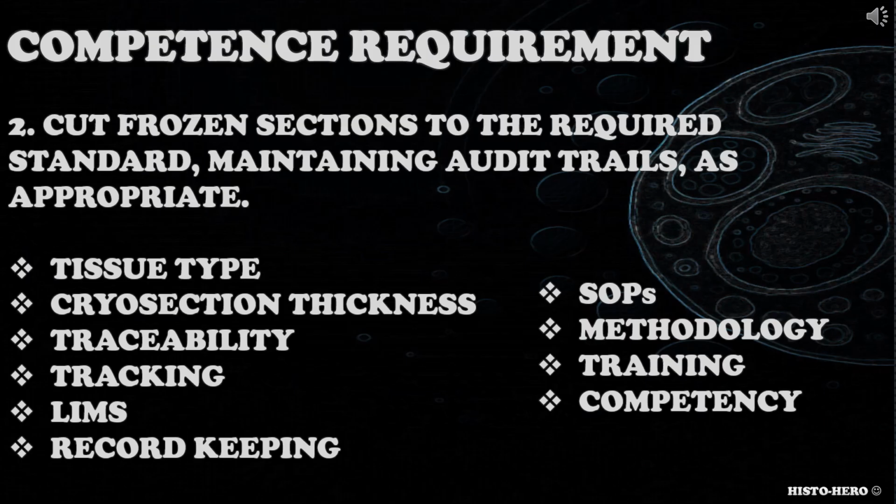When addressing this competence requirement, candidate could consider tissue type, cryosection thickness, traceability, tracking systems used in your lab, LIMS system used, record keeping, SOPs and methodology used, their training and competency and so on.